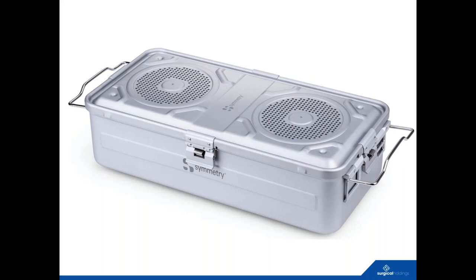And obviously getting some sort of testing on these to try and do some sort of in situ validation, which is not easy, but is an important factor, because again, it's a mechanical device. Having them regularly checked, or developing an SOP so you check them regularly yourself. Again, it's time though, Bob, isn't it? It's trying to establish these good practices and making time for it.